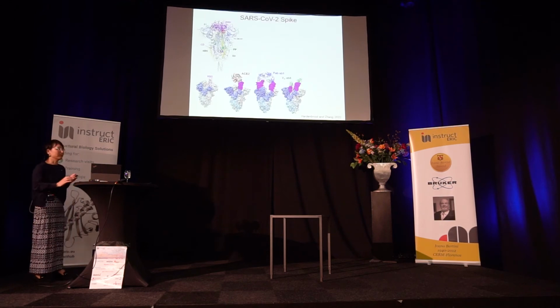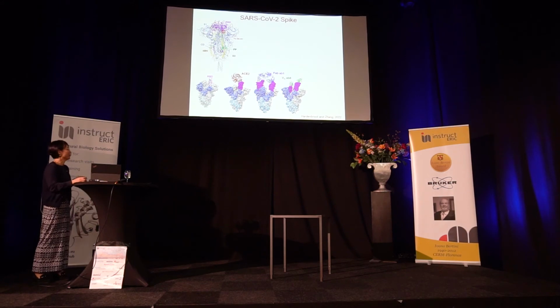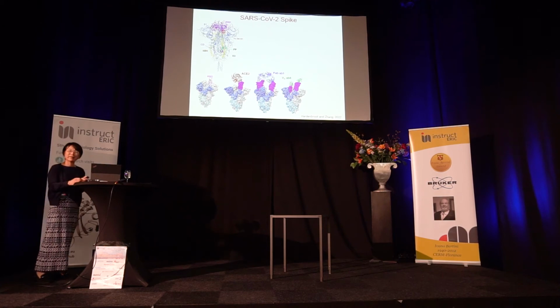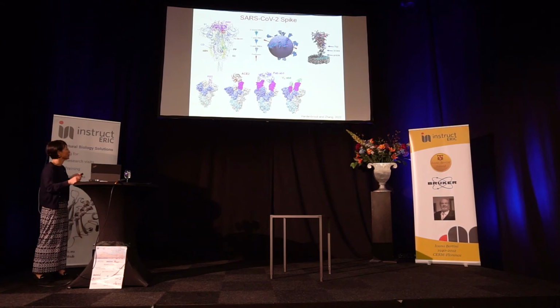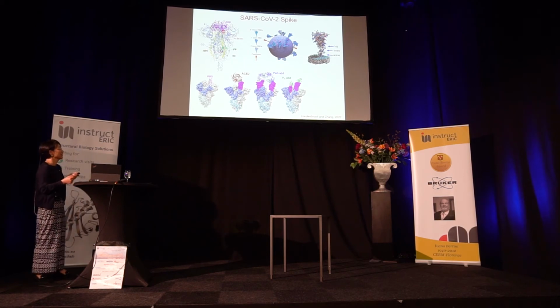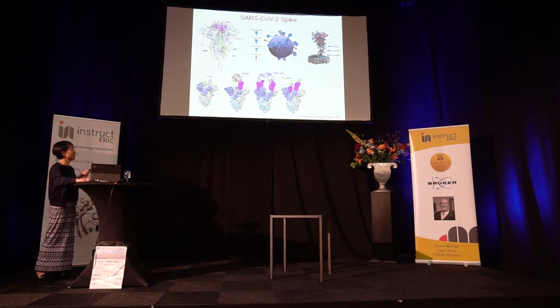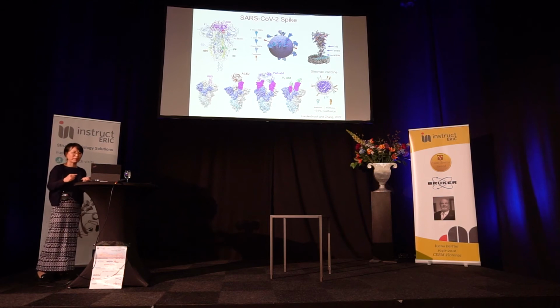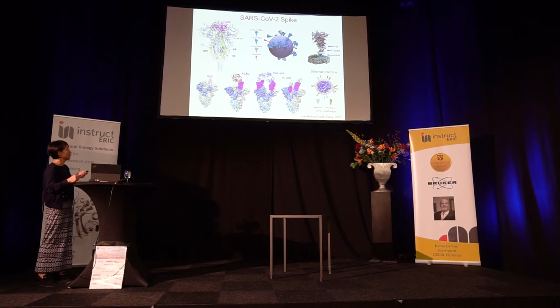You heard yesterday that, due to COVID and the whole world being involved, the public was involved in COVID research. There are over 900 structures of spike. Those are mostly purified, isolated spike protein alone or bound to an antibody or the receptor. There are also structures of spike protein on virus particles by John Briggs and Martin Beck, and Ning Zhang in China. We also did purified virus particles inactivated in a different way, using beta-propiolactone instead of paraformaldehyde. Those in situ structure studies show that there are pre-fusion spikes as well as post-fusion spikes.